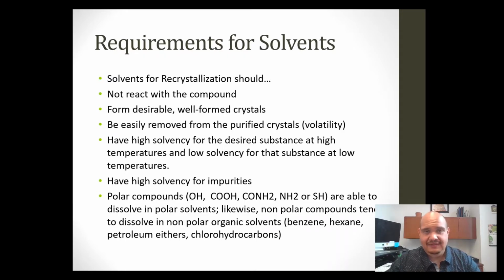Requirements for solvents. Solvents for recrystallization should not react with the compound. This is not a chemical reaction. If your solvent reacts with your solute and it makes something new, you didn't purify it. You synthesized something. So the solvent cannot react with the solute. Otherwise, it's going to be something different by the time you get it back.